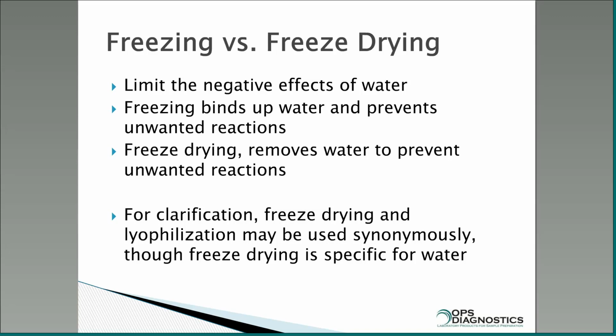Also, for clarification, I'll be talking about freeze drying. It is really the same as lyophilization, but lyophilization can often be used to talk about other solvents, while freeze drying really focuses on water.